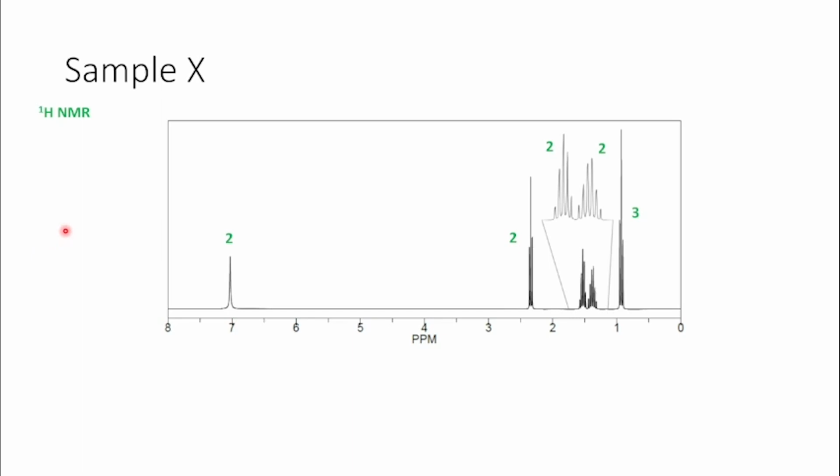Now, the last thing we look at is the proton NMR spectrum. And before I do anything looking at this spectrum, I want to draw in what I think is the start of my molecule. So I know I have 5 carbons. So I'll draw those down first. And don't forget I have a nitrogen somewhere. The next thing I do is look at the very end of my spectrum, 0 to 1.